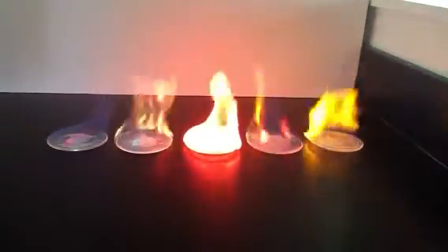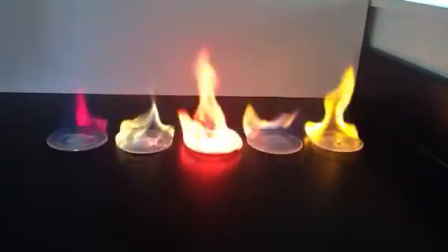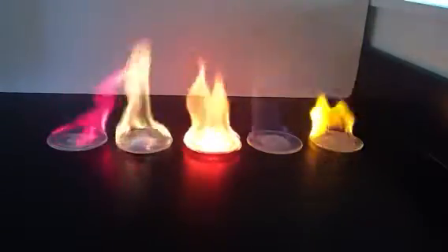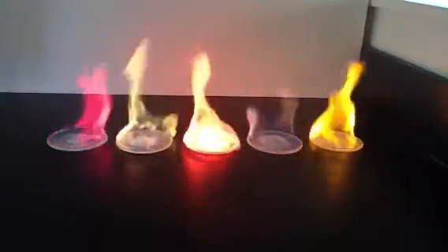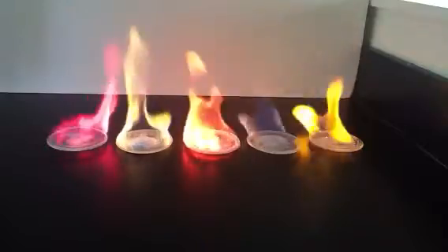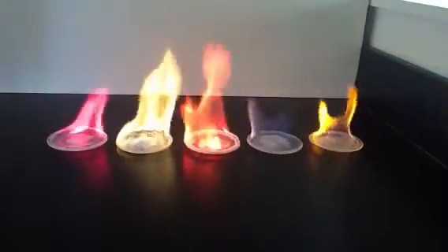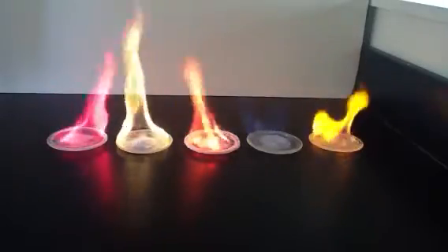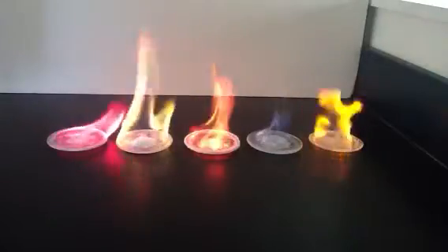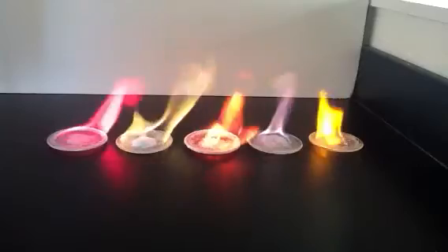Now you can see them burning and you see different colors given off by each one. On the right, you have the sodium — it's giving off an orange color. Next, you have potassium, which gives off a purple color. In the center, you have the strontium, which gives off a red color. Then you have barium, which gives off that greenish color. And over on the far left, you have the lithium, which has a really bright, hot pink color.